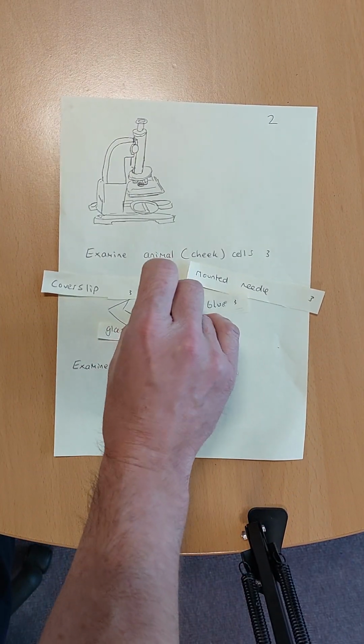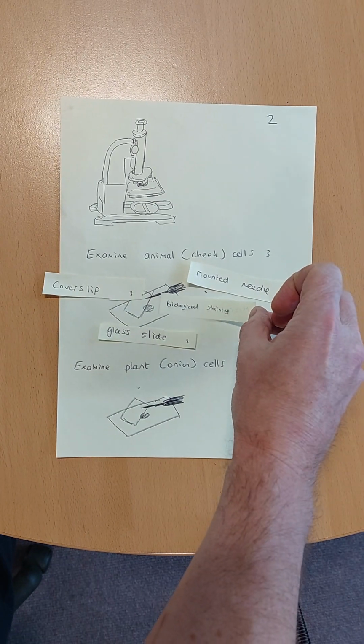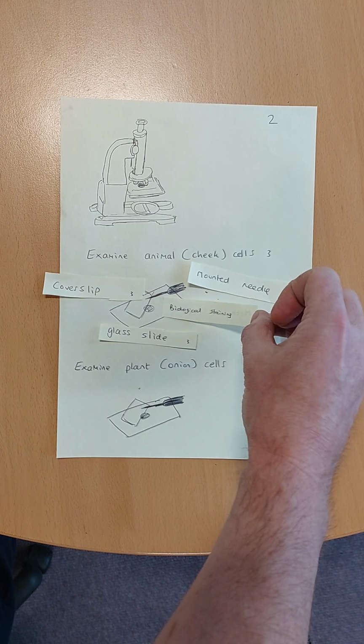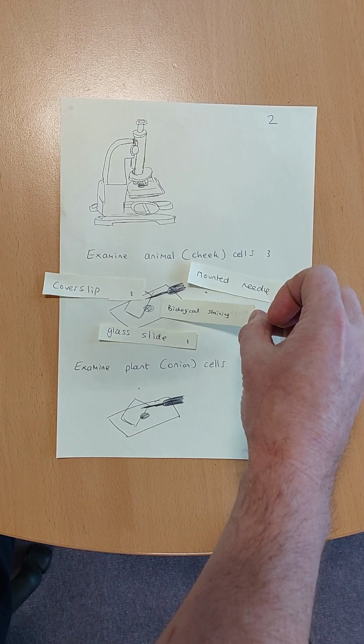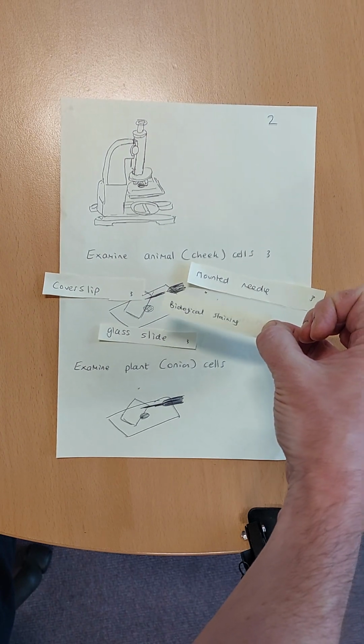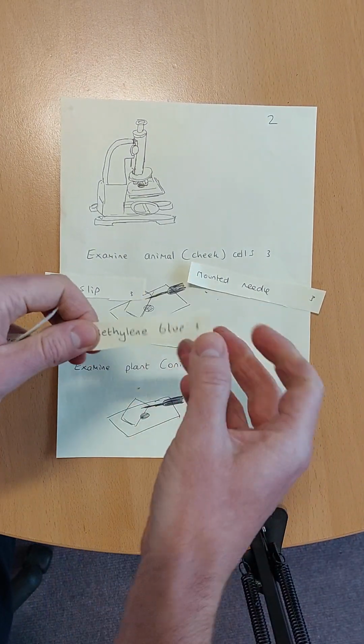Something else worth knowing, we call this biological staining. The methylene blue will stain those cheek cells and it will make them stand out really nicely when we look at them in the microscope. So that is biological staining.